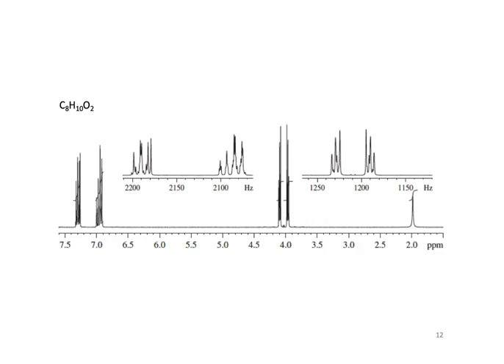Okay, what about this one? A benzene ring. Yep, benzene ring. Let's see if I can figure out the... You can't really see this. I think it's like this. Okay, so we've got a benzene ring. This and this and this and this. How many unsaturations are there? 4. 4? It's 4, right? 8 minus 5 is 3 plus 1 is 4.